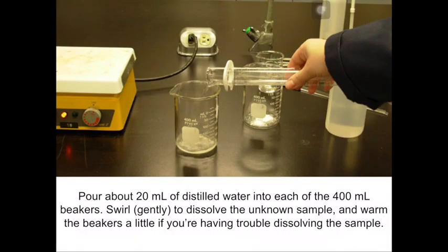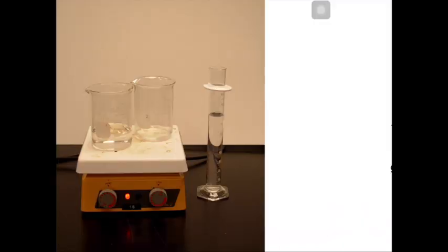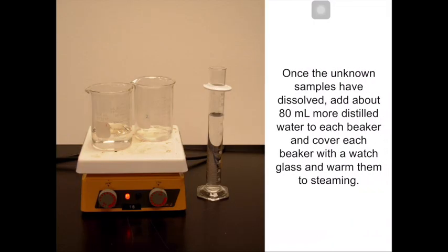What is being done here is adding some water to it in order to dissolve the sample. The sample here is a soluble carbonate salt. The soluble carbonate salt is precipitated using calcium chloride in order to make calcium carbonate precipitate. At this stage, the soluble carbonate salt is dissolved using distilled water, and it is heated atop a hot plate in order to completely dissolve the soluble carbonate salt.